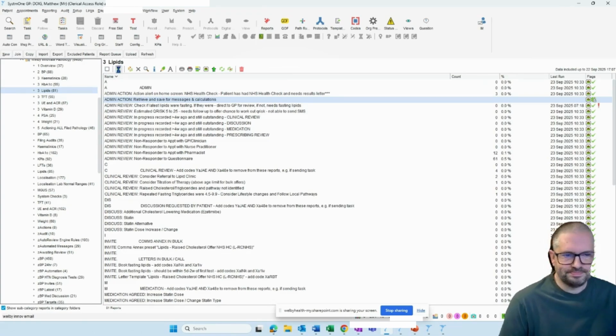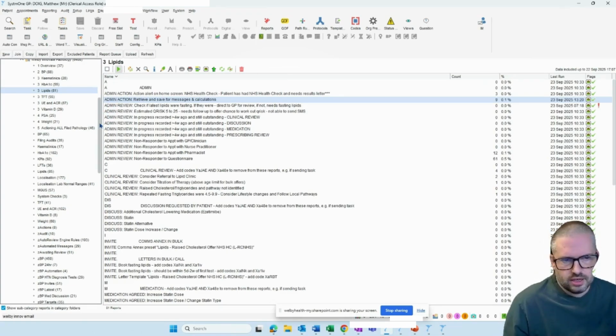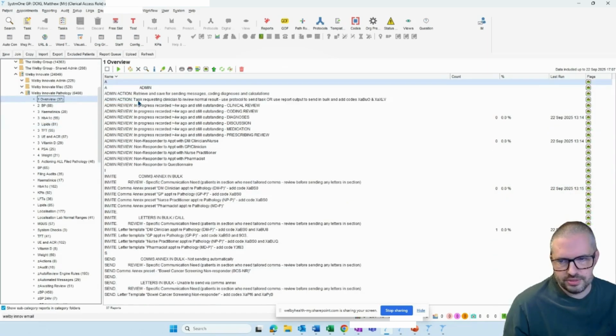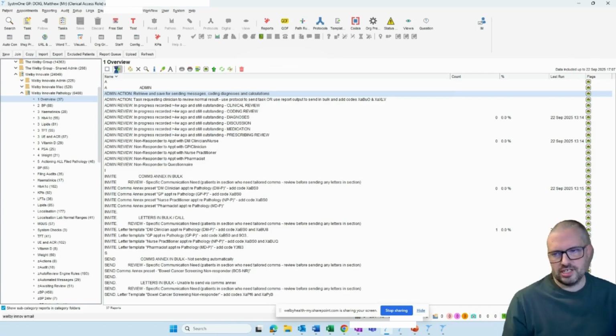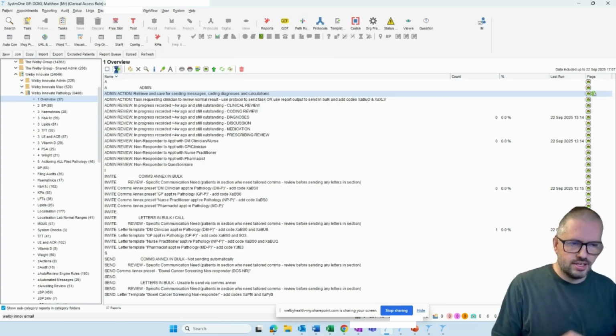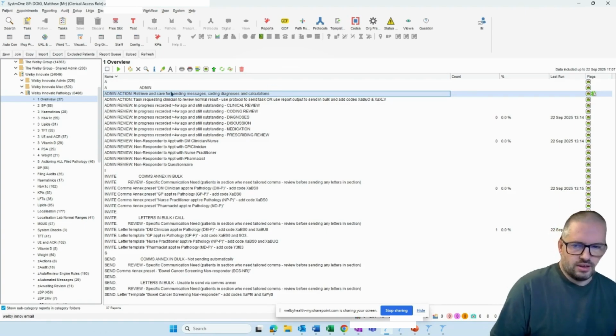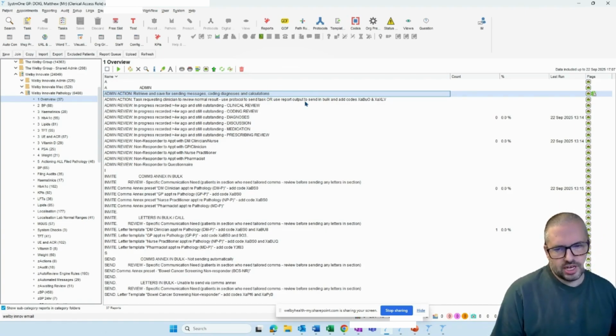If you're using multiple pathways, which I imagine most of you will be, you may also want to look at using this overview section. Some practices have pointed out what can be a bit frustrating with the retrieve and save reports is you go through one list and then you get to the next one and realize some of the patients in there have already been retrieved and saved. So this one pulls together, it's a bigger report, but all of the possible outcomes that need that doing for all the different pathways that you've enabled and all the automations you've enabled. So again, once a week, probably at least, that's one for someone to clear.